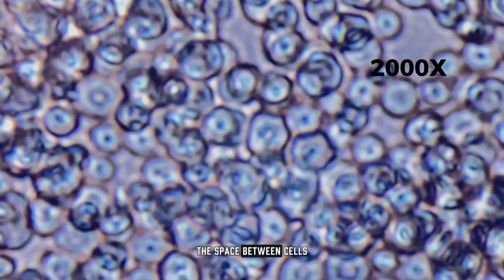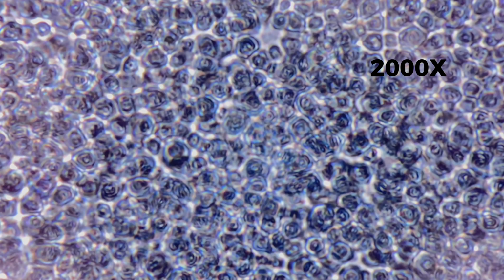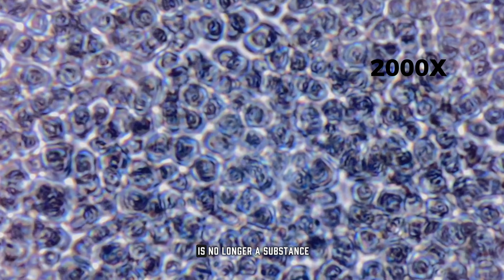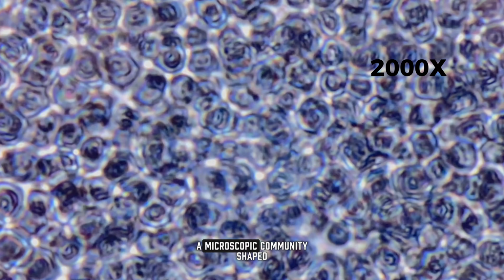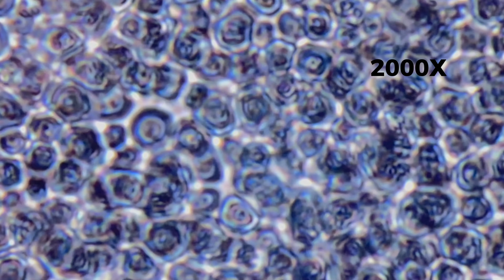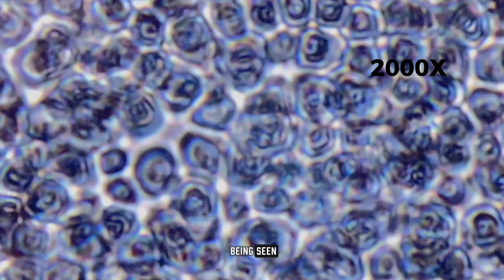The space between cells is minimal, creating a tightly packed mosaic. Nothing here suggests flour, dough, or baking. This is no longer a substance, it is a system, a microscopic community shaped by growth, pressure, and time. A quiet process that drives change without ever being seen.